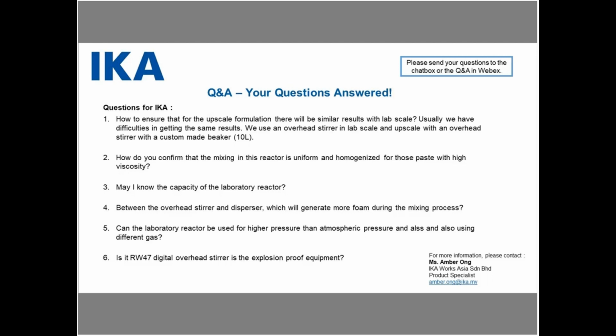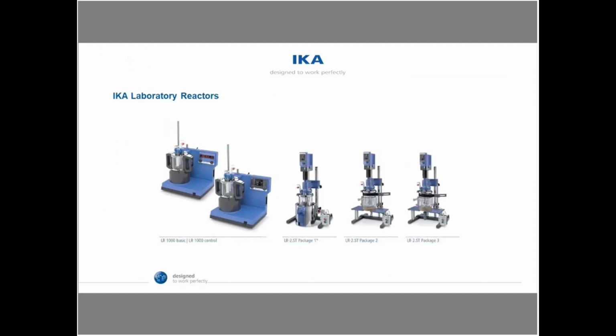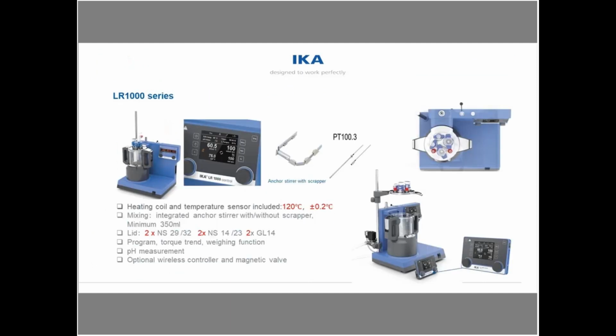I also see there is a question from the chat box asking, for the lab reactor, if we program 10 steps, do we need to click start before each step in order to proceed to the next step? As I mentioned, the LR1000 reactor has the program mode. It can be set up to 10 steps. Basically you don't need to activate each step. Once you activate program one with the 10-step information, it will run the steps according to the time you set.